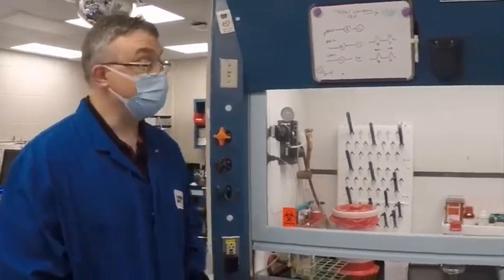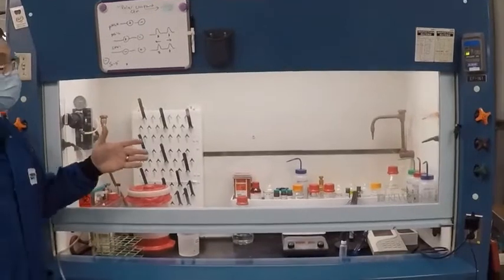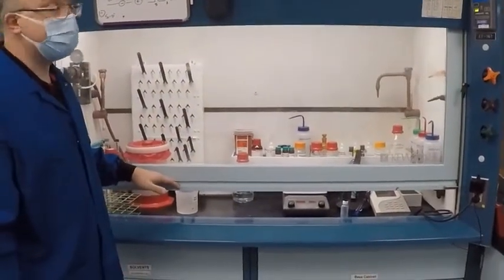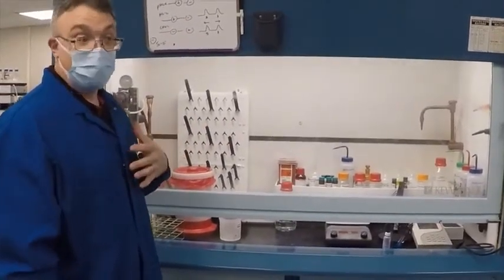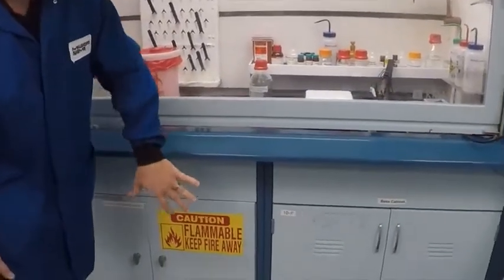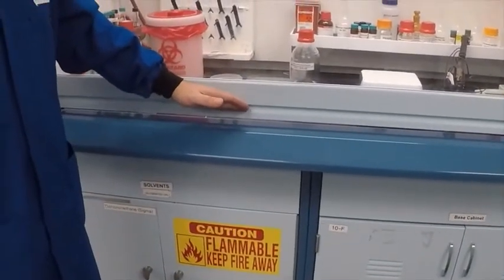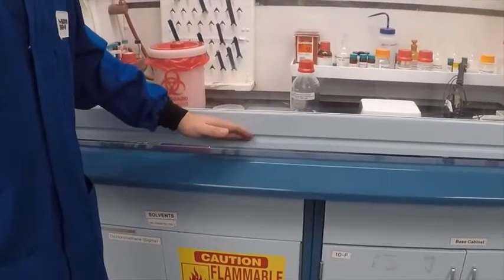One of the main safety features in any chemical laboratory is a fume hood. The fume hood consists of a few different parts. One of the most critical is the safety sash, which is used to keep chemicals that could potentially splash on you away as you work. The airfoil part of the hood, when the sash is all the way down, allows the airflow to accelerate and sweep any hazardous fumes, odors, or vapors out of the hood.